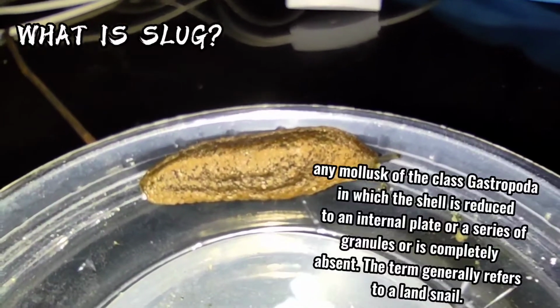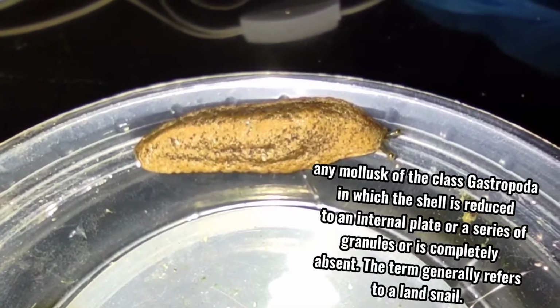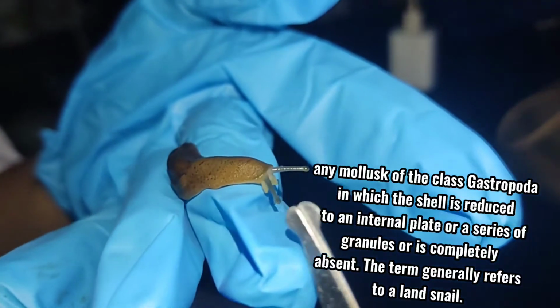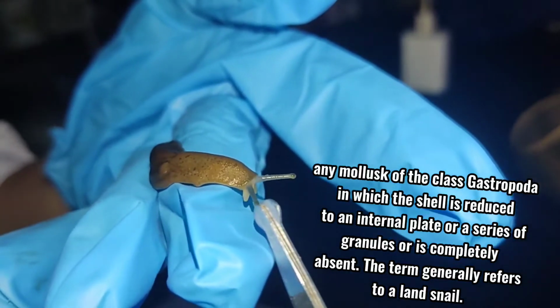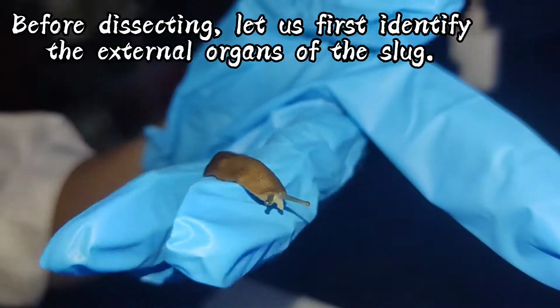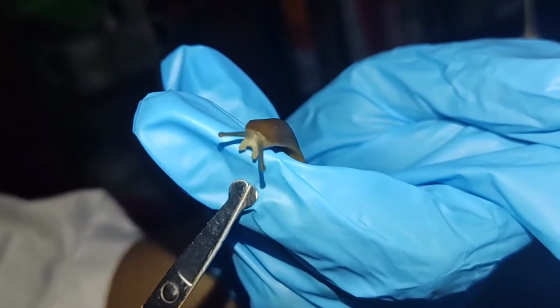So, what is a slug? An animal of the class Gastropoda, in which the shell is reduced to an internal plate or a series of granules, or is completely absent. The term generally refers to a land snail. Before dissecting, let us first identify the external organs of the slug.